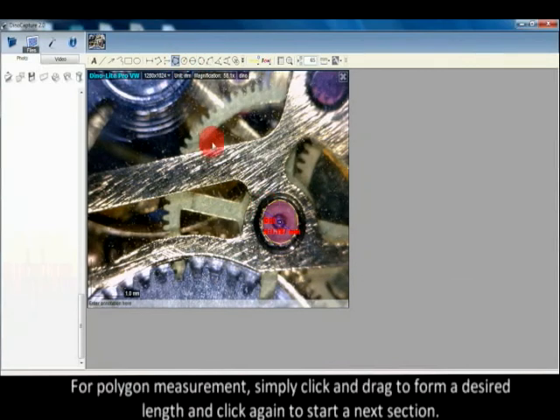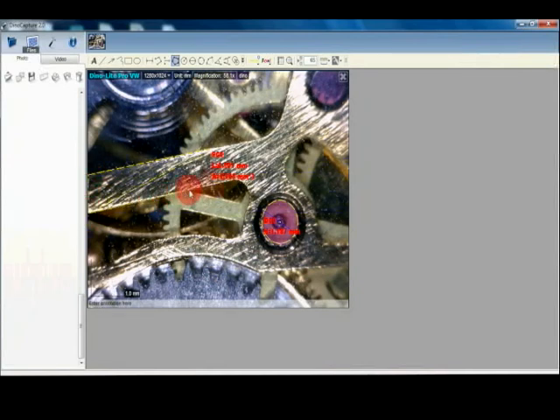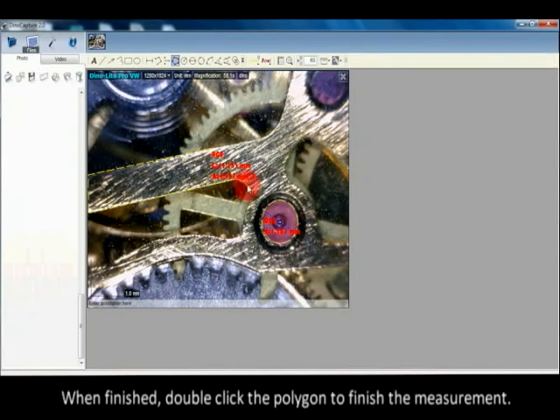For polygon measurement, simply click and drag to form a desired length and click again to start the next section. When finished, double-click the polygon to finish the measurement.